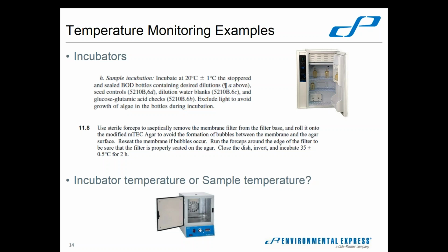So here, we want the actual incubator temperature and the sample temperature to be the same. And again, most of the time, you've got your temperature readouts on the outside of your incubator, but we can't use those as the official reading because they're from those untrustworthy manufacturers, and who knows how they measure temperature. So everybody's got their own NIST traceable or NIST calibrated thermometers inside their incubators, also recording the temperature, and those are the ones that you read.